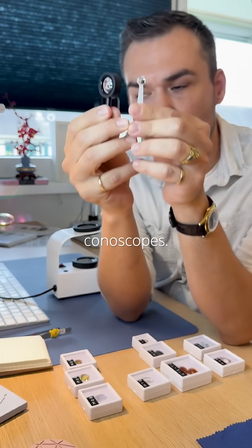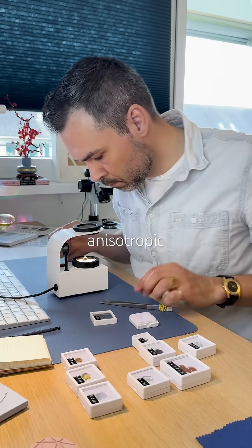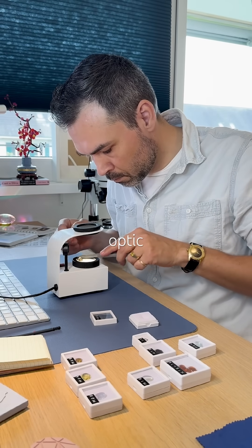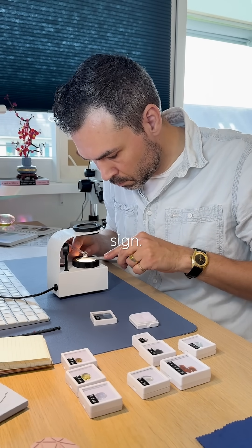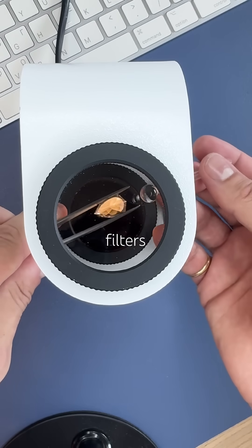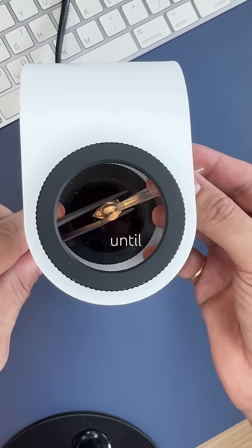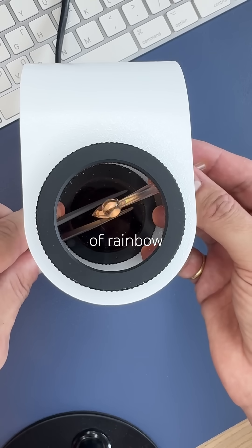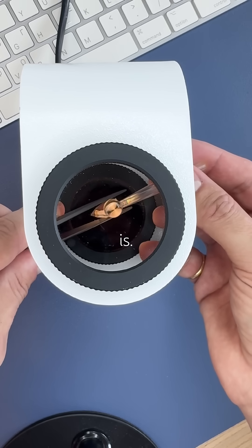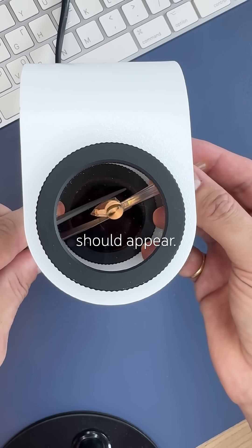These are conoscopes. Used with a polariscope, they help us find the optic axis in anisotropic gems and reveal their optic sign. Here's how it works: place the gem between the two crossed filters when light is fully blocked, then move the gem around until you see a flash of rainbow colors. That's where the optic axis is. Place the conoscope right on that spot and the optic figure should appear.